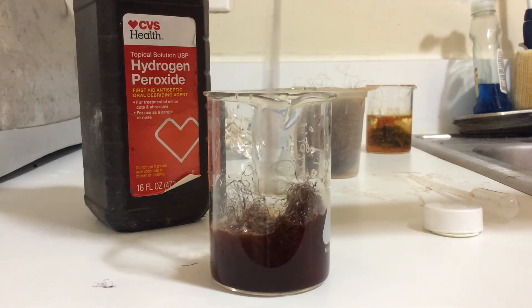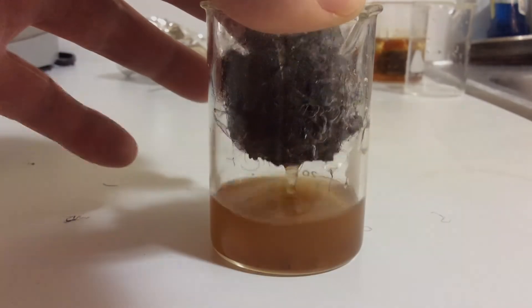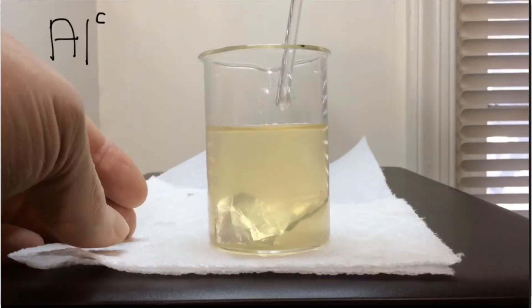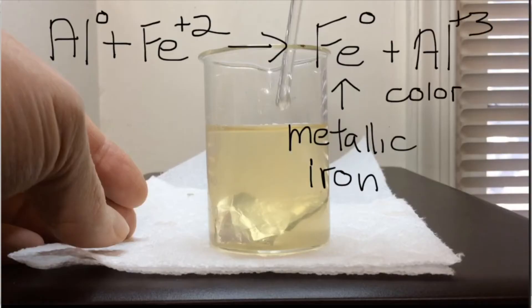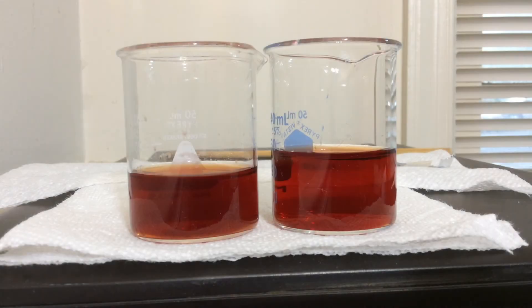For fun we can add some more steel wool and get the solution back to the iron(II) yellow state. The last step is to see if we can get some aluminum to reduce the iron(II) ions back to metallic iron — as the yellow iron(II) ions leave the solution it should clear up and become colorless. But nothing is happening after 12 hours, so I need to figure out what to do next.